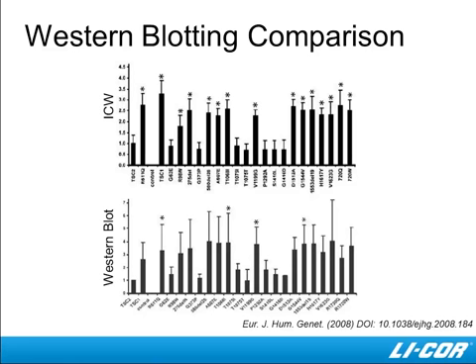When you look at this data, the key things to understand is that this group was screening 20 different mutants. The hypothesis was that these mutants would increase the phosphorylation level of a target protein. And it would increase this level of phosphorylation to different degrees, depending on which mutant you looked at. So whether they did a traditional Western blot or the In-Cell Western assay, they were quantifying the phosphorylation level of their target protein.